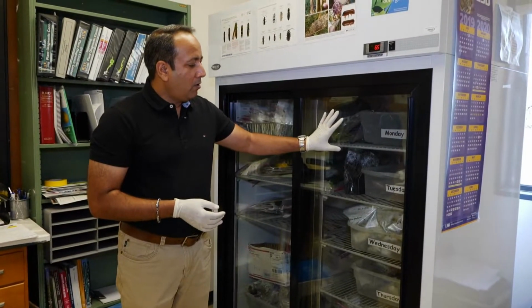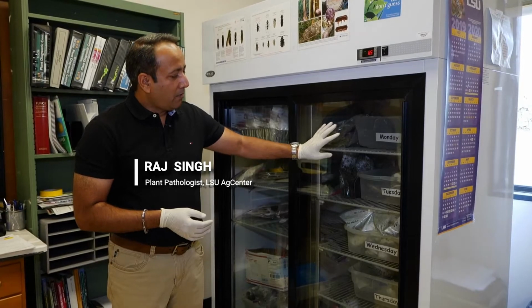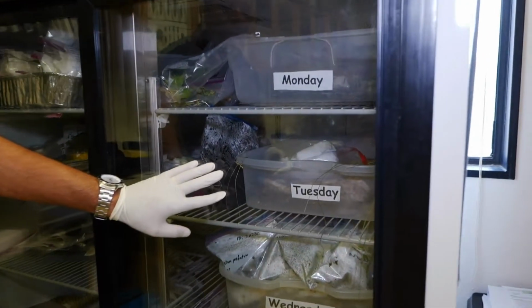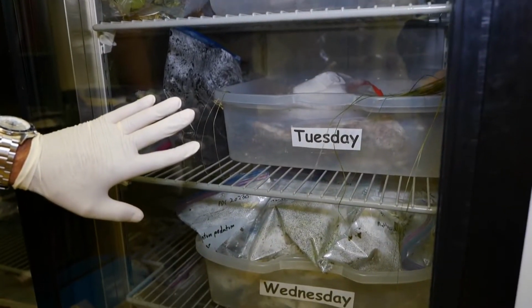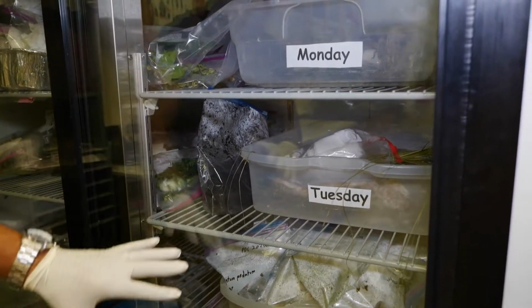So we also categorize our samples depending upon which day we receive them. If you send a sample on a Monday and we receive it Tuesday, that will go in Tuesday, so that if we have to go back, we are not looking for the sample. So we are very systematic here.